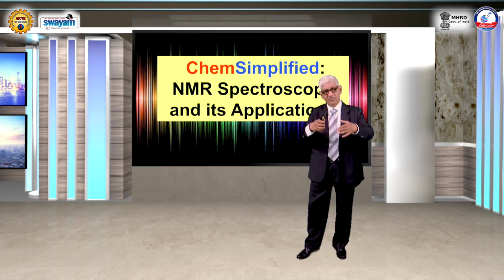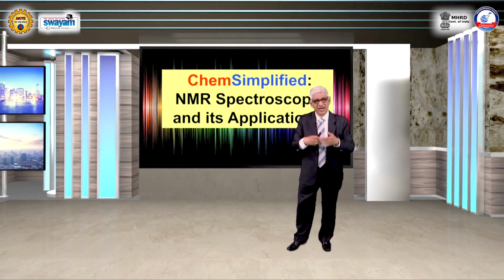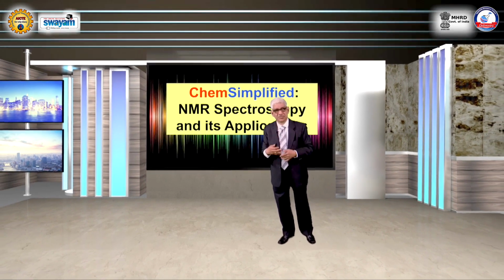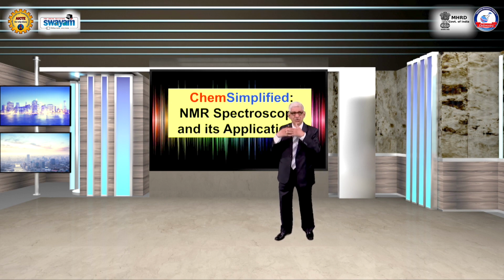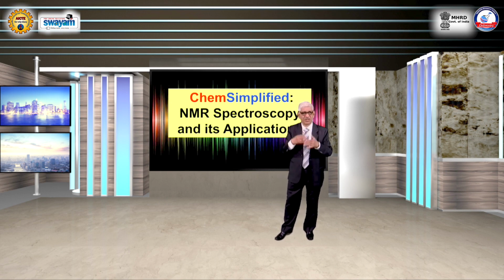I showed you examples of a dipeptide. You take a dipeptide, what sort of peaks you get in a COSY spectrum, and what sort of peaks you will get in the NOESY spectrum. The COSY spectrum gives you a spin system kind of identification in a given peptide. So if I have a valine residue, you get peaks specific to the valine residue. Likewise, if I had a threonine, you would have obtained a spectrum which is specific to the threonine.